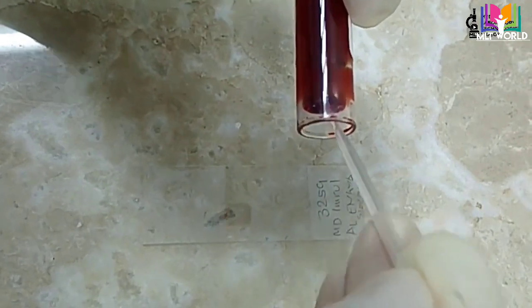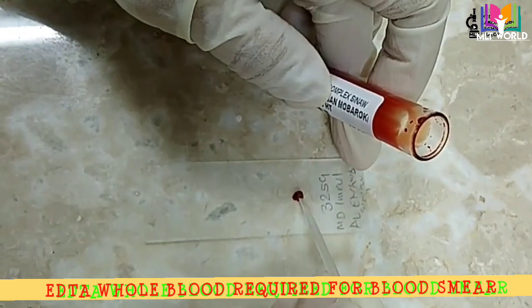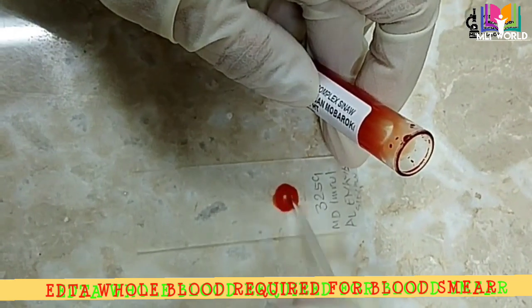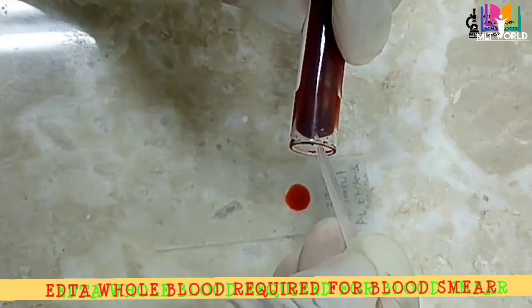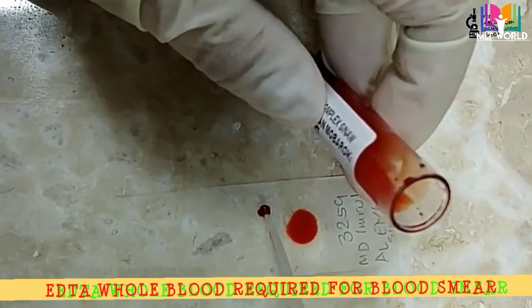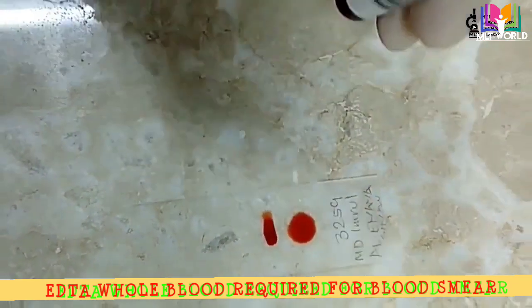First I will show you how to make a blood smear — both thick smear and thin smear. For the thick smear, we take one drop and just move it in a little circular round movement, and then the small smear is ready.